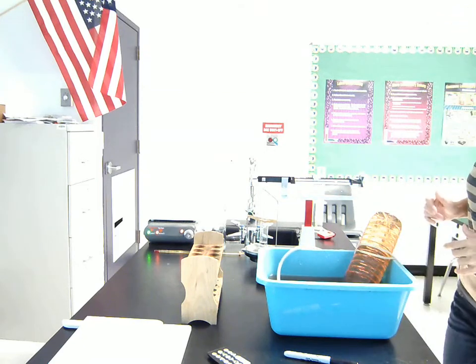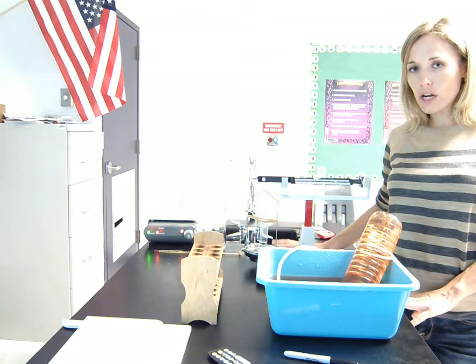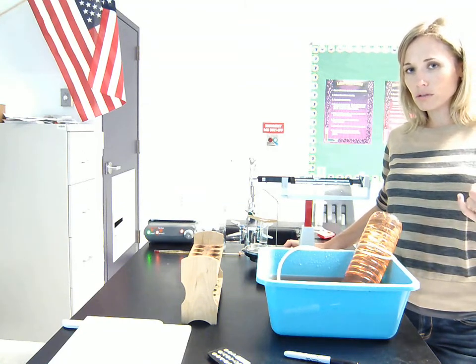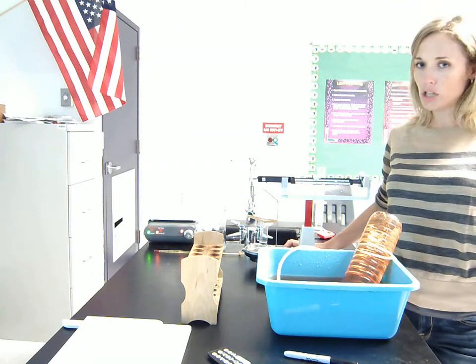The mass part, we're going to be using what we know of the law of conservation of mass to figure out the mass of the gas. And we've done part of this before when we did the Alka-Seltzer lab in chapter 2.